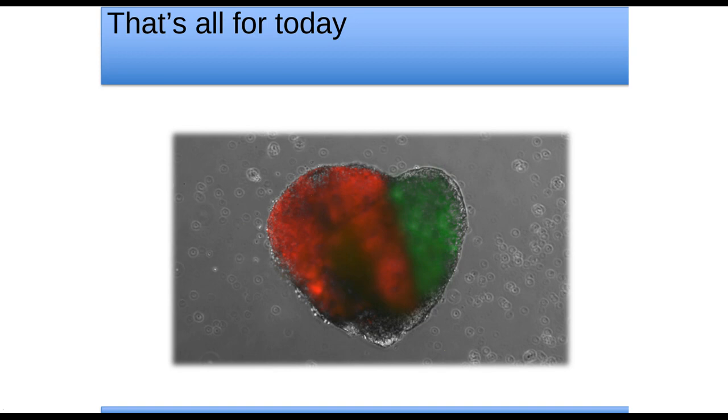There are also other options out there for commercially available sorting solutions that somewhat increase the viability of cells. But make sure you have a good sorting buffer. As I said, it can be as simple as PBS without calcium and magnesium, supplemented with HEPES. That works for us. And then one important feature, I'd say, is to make sure that the cells are cold at all times, so when we use our sorting buffer, we pre-cool it. We make sure that everything is cooled.